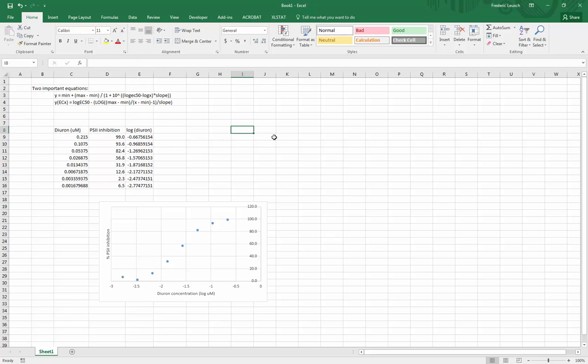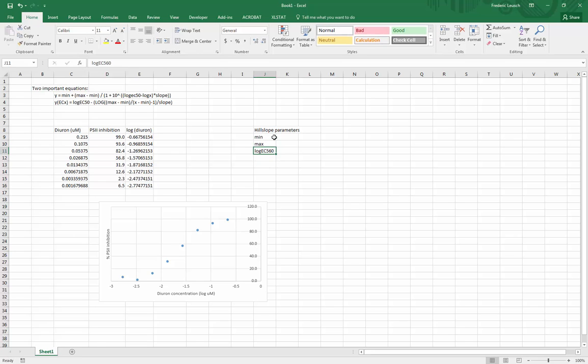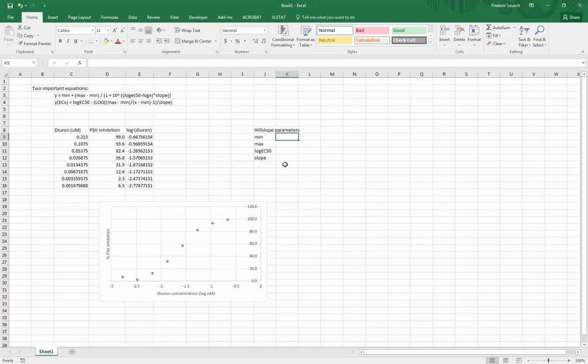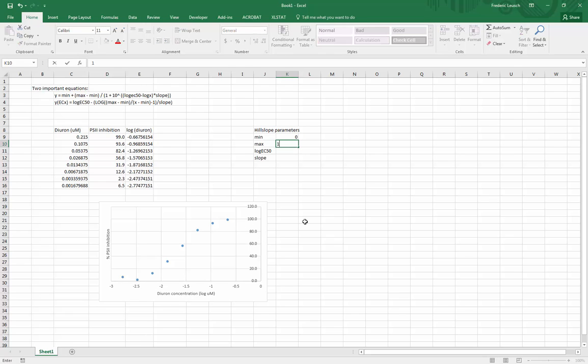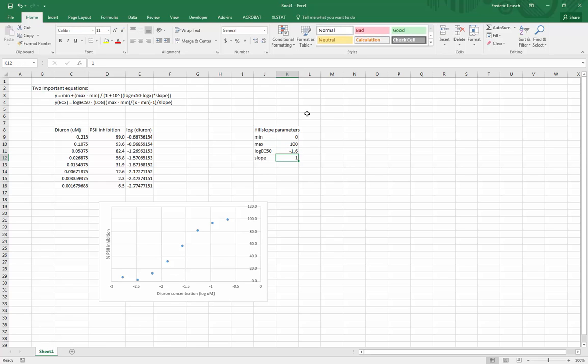So to be able to fit that in Excel I'll need a little box here where I'll set my Hill slope parameters. So remember I'll have min, max, log EC50, and the slope. So min in this case is always going to be zero percent. My lowest possible effect will be zero percent in this assay. My highest possible effect is a hundred percent in this assay. Slope, a good starting point is one, and the software will figure it out for you but it's always nice to give it a starting point. And likewise here the EC50, if I had to eyeball it I'd say it's probably somewhere here minus 1.6. But again the computer will calculate it for you.